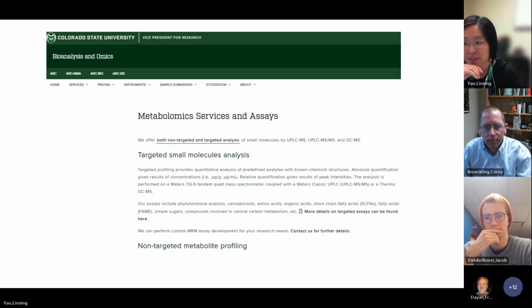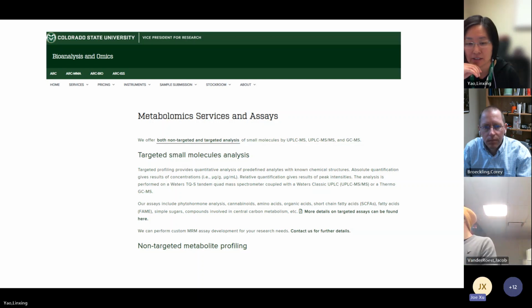Hi, Linxing, and thank you for this excellent presentation. I just have one question on the potential impact of the type of instrument on the sensitivity of your different types of analysis. Generally speaking, the analysis is quantitative. So I can see we may use a triple quadrupole or QTOF for targeted analysis. Is that correct? Yes, correct. In theory, you can use both.